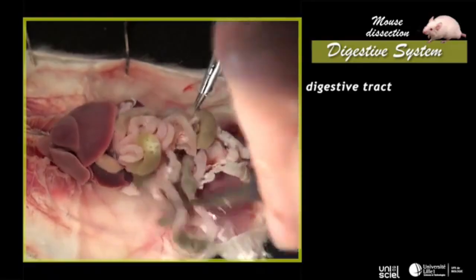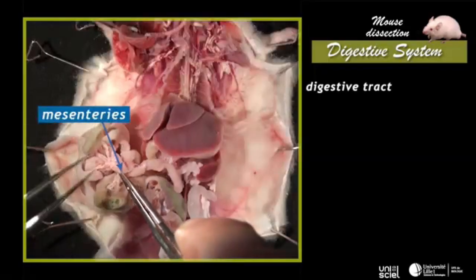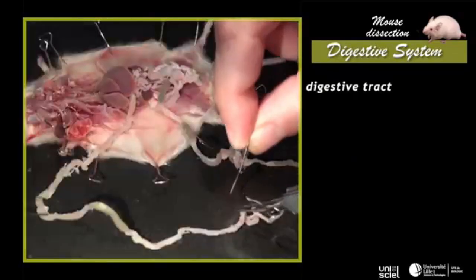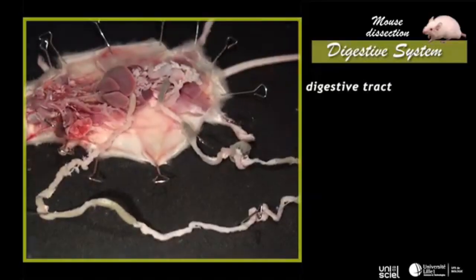Mesenteries that link the intestinal folds are delicately torn by pulling on the digestive tract. The unrolled intestine is pinned on the side of the animal.